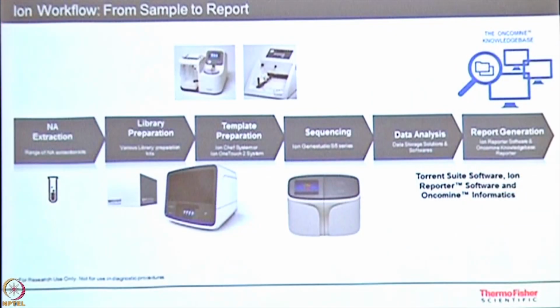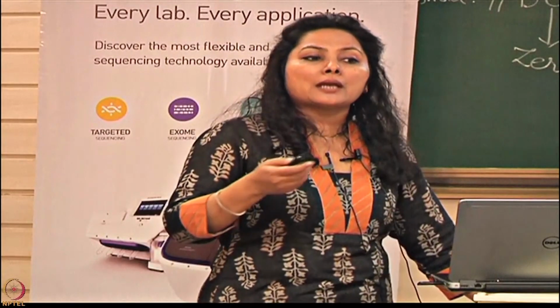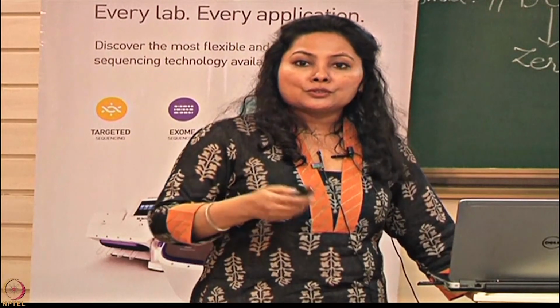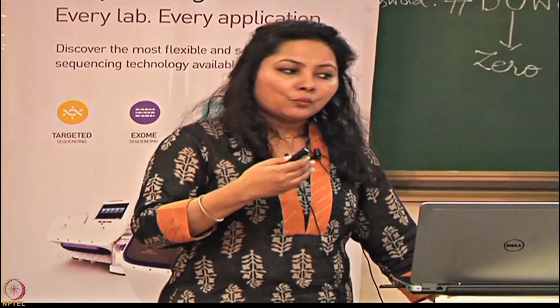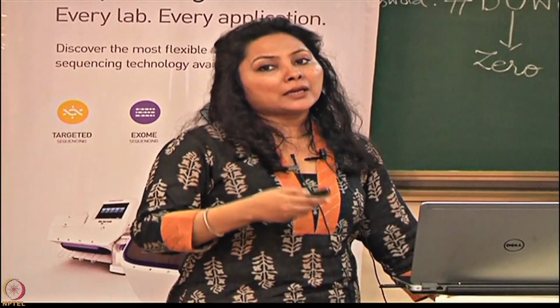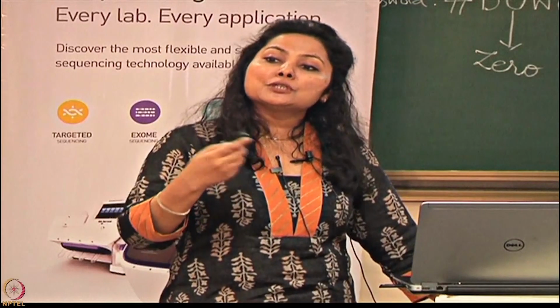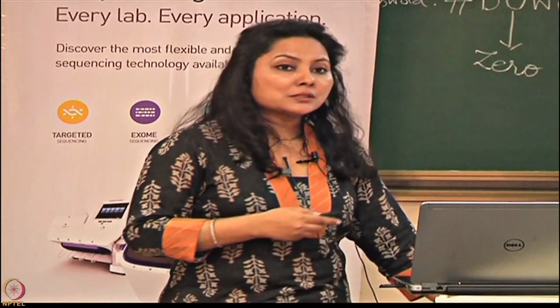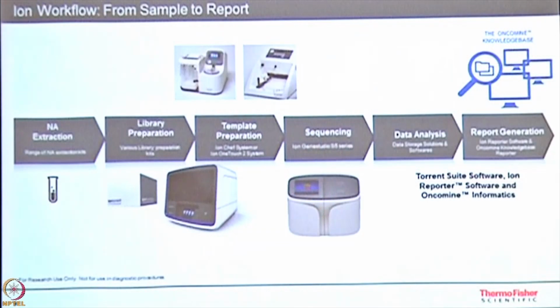Then comes template preparation. Now these are the things which are specific to a technology. In template preparation, you are taking these library molecules and amplifying them onto ion spheres. So we are talking about Ion Torrent technology, where we are using ion spheres as the mode. These ion spheres get loaded onto the chips, and finally these ion spheres are carrying those regions of interest, those library molecules, from which you are generating all those reads. That process of taking these library molecules and amplifying them onto the ion sphere is called template preparation.